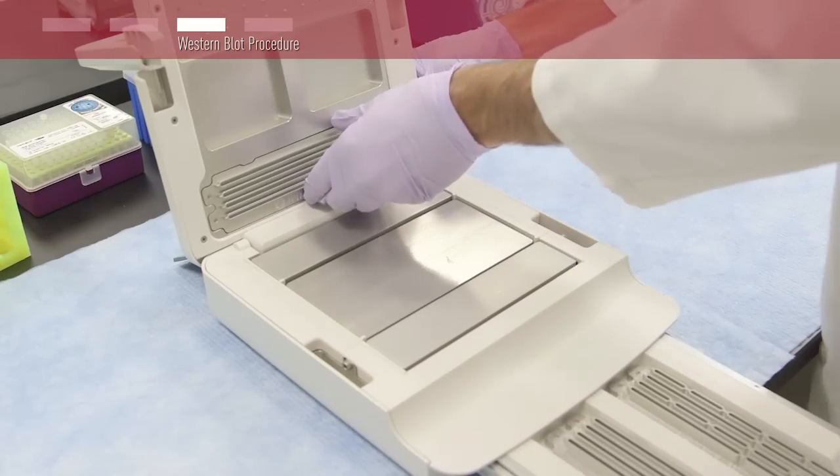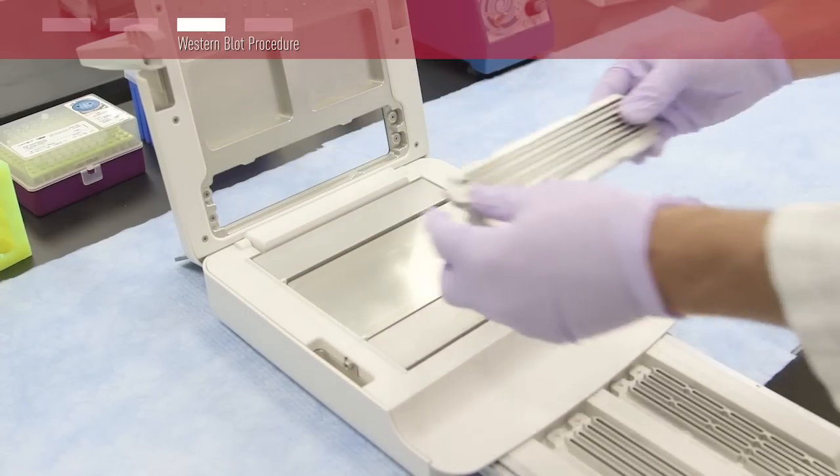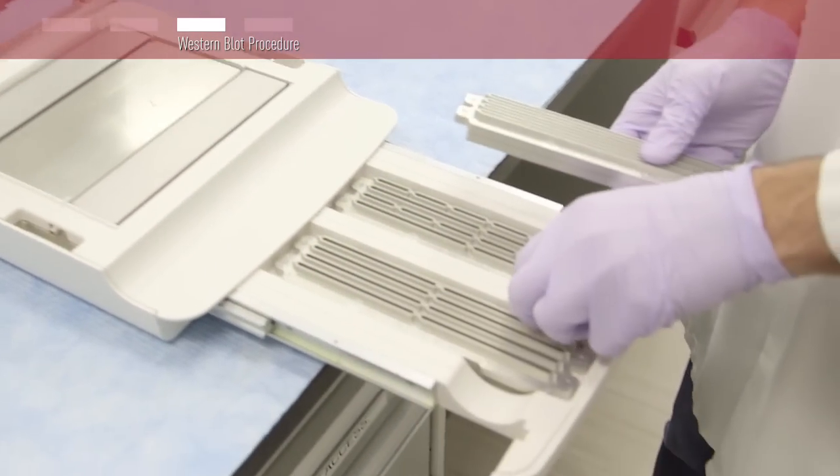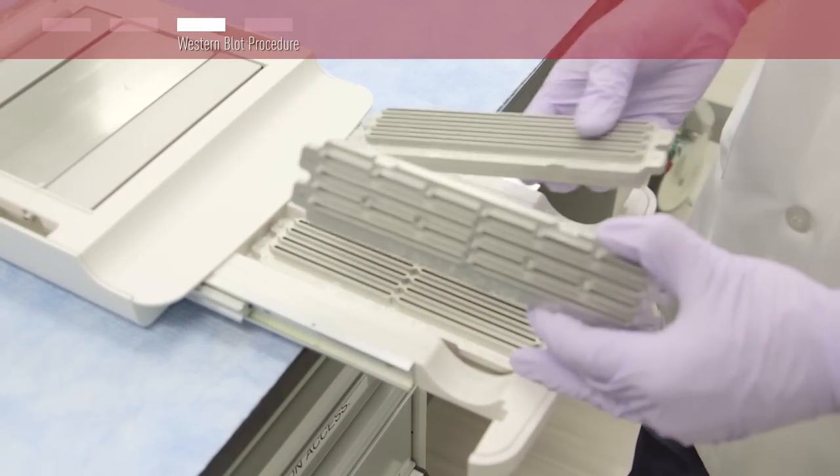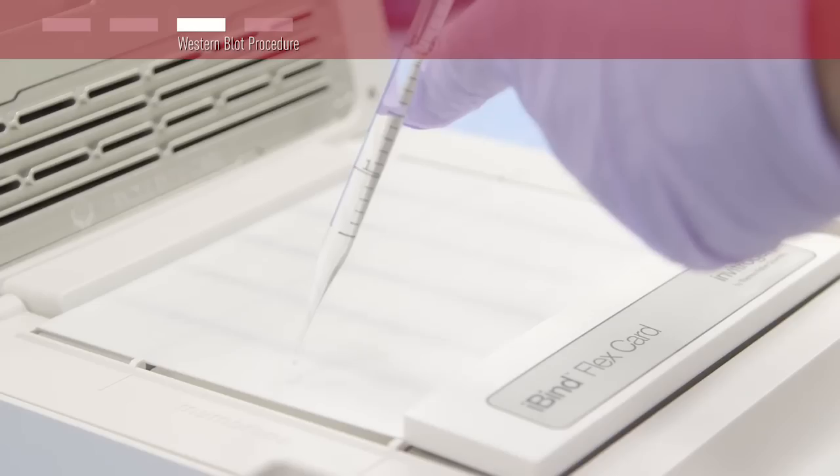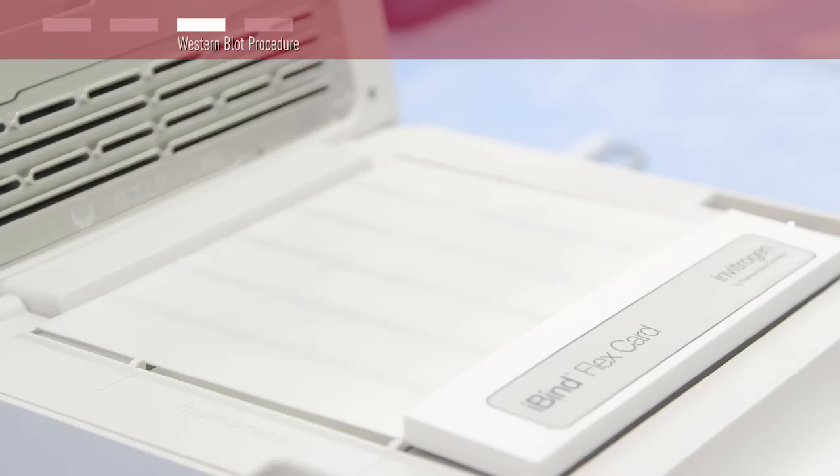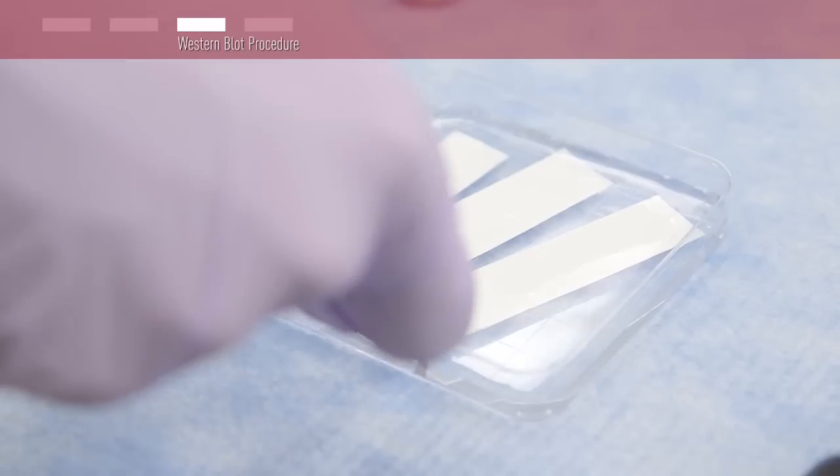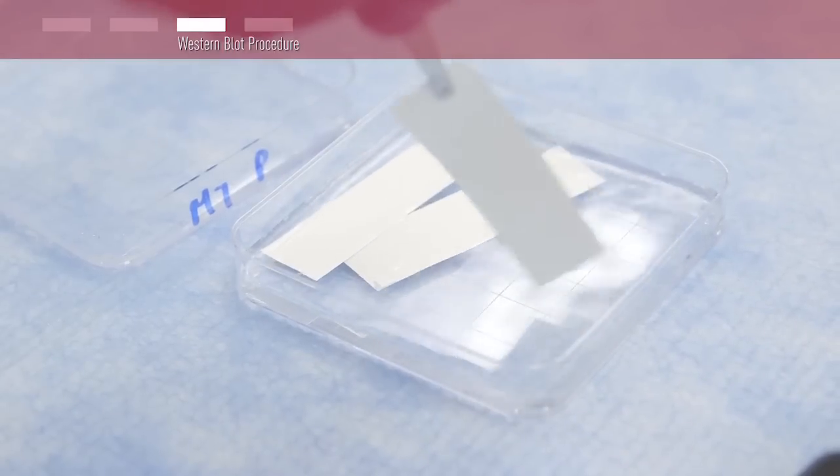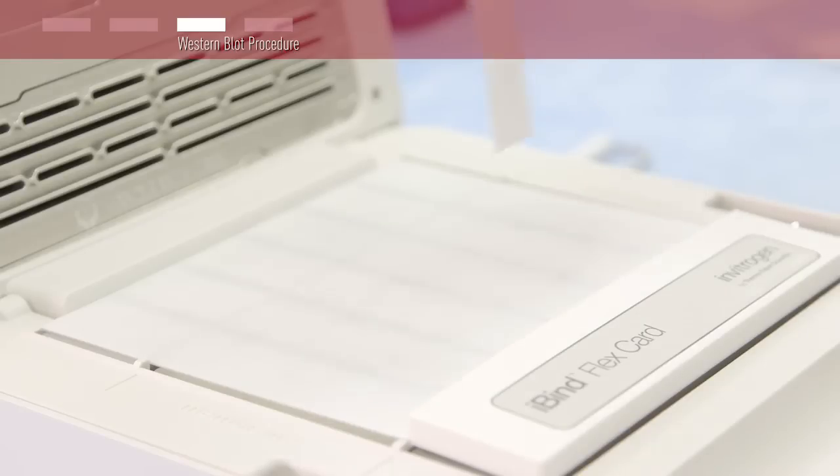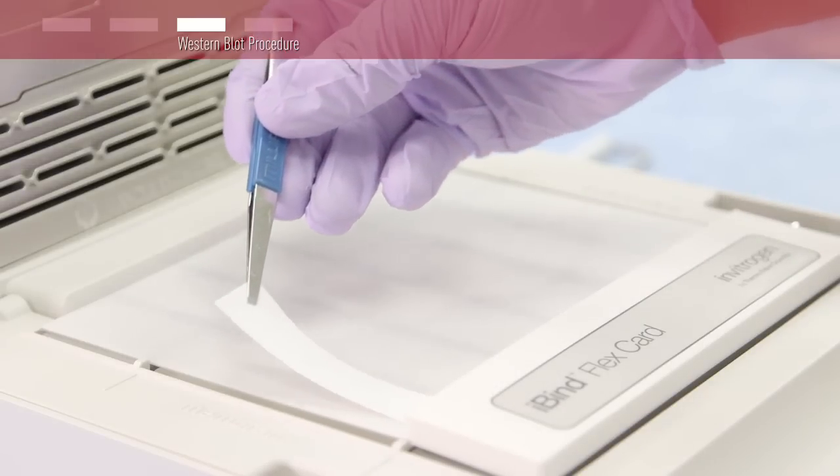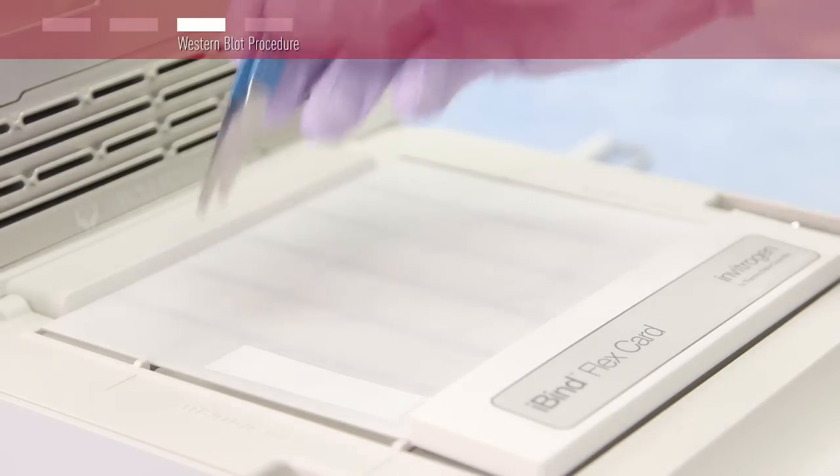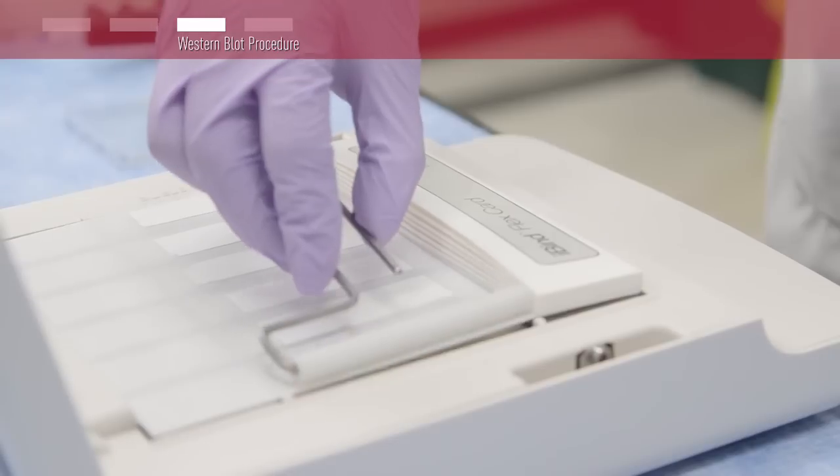In order to process up to 6 vertically cut strip blots, start by installing the multi strip well insert. Add an additional 2 milliliters of 1X iBind Flex solution to the card, allowing it to pool per the quick reference card for the multi strip well insert. Use the alignment guides to place your blots in the white spaces between the black lines. Continue with rolling the blots to remove air bubbles.